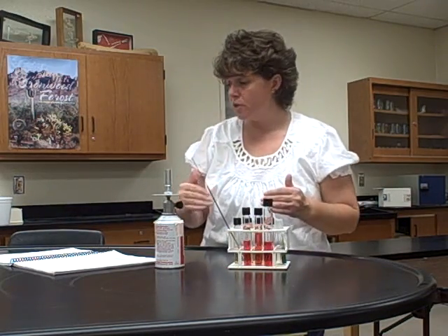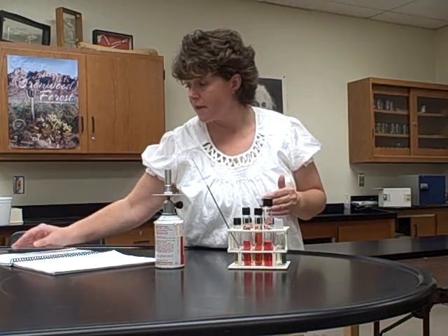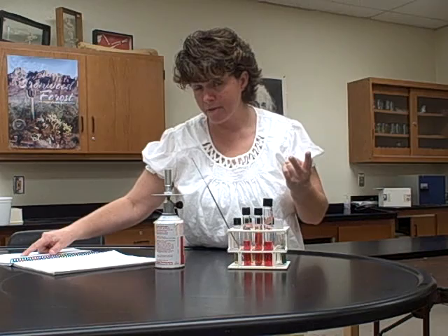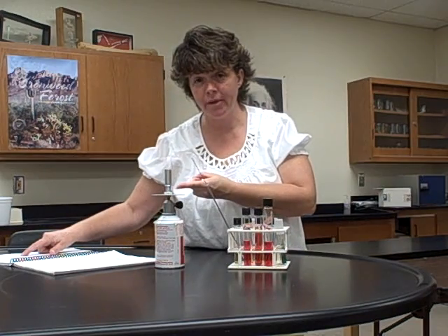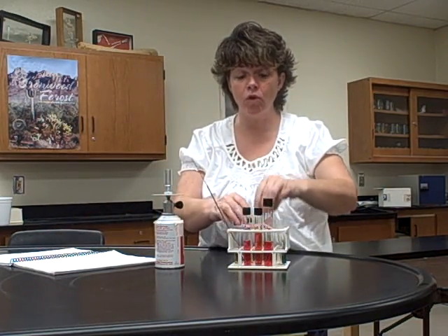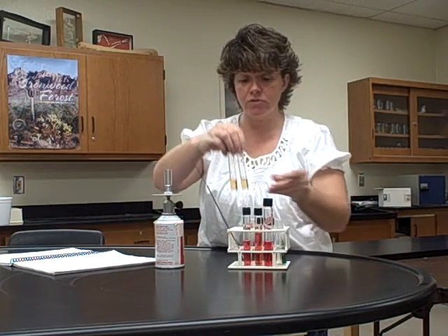Now, you'll notice there's a second procedure called MRVP test. For that procedure, it says inoculate 2 MRVP tubes with E. coli and 2 with Enterobacter. So that's why you have 4 tubes. You're going to be putting E. coli in 2 of the tubes and Enterobacter in the other 2 tubes.